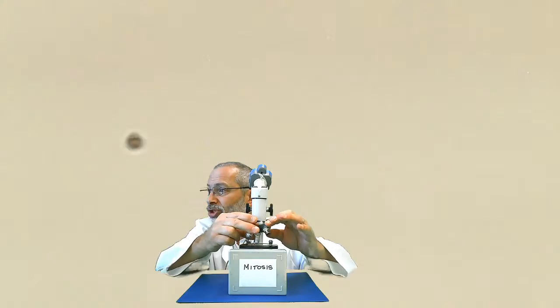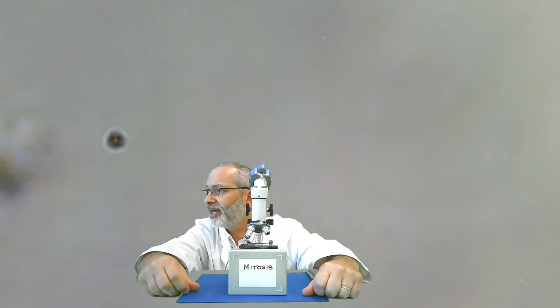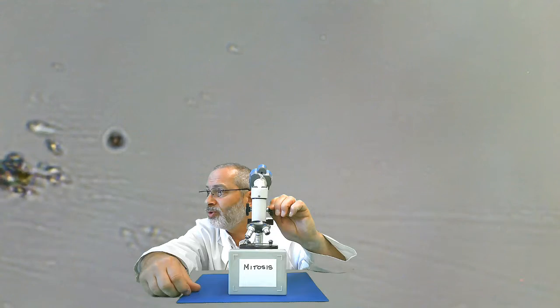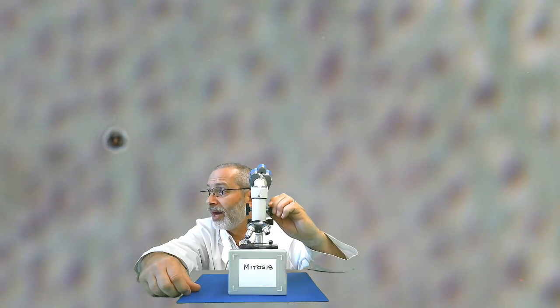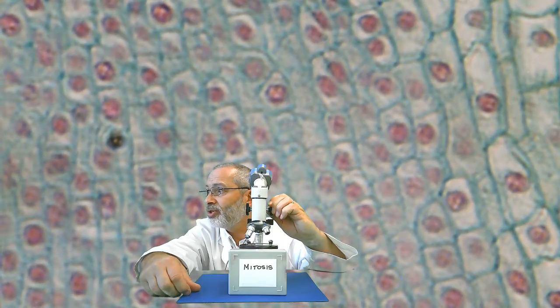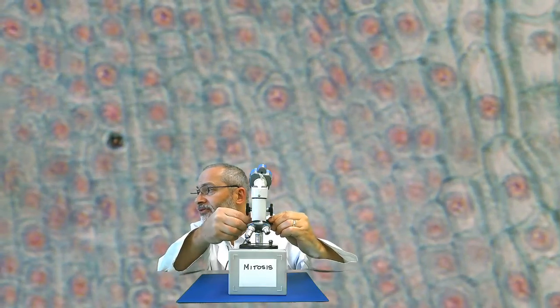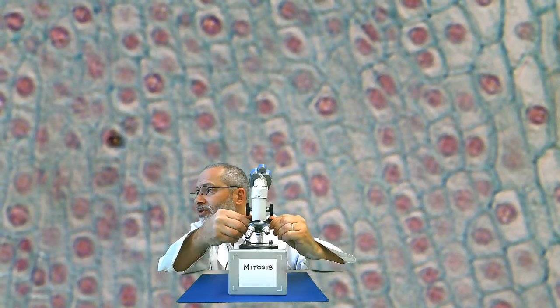So I'm going to adjust our microscope, allow the digital camera to compensate for the light. And oh my, I don't see anything yet. It's still blurry. So at this point, we can use the coarse adjustment knob still to pull the body tube away from the stage to get it into focus a little bit more. We can use our fine adjustment knob to fine tune our view.